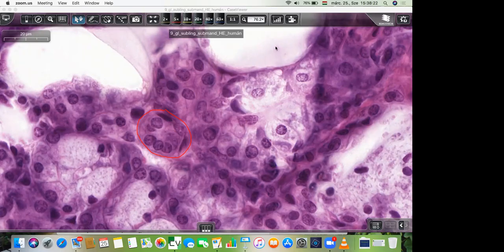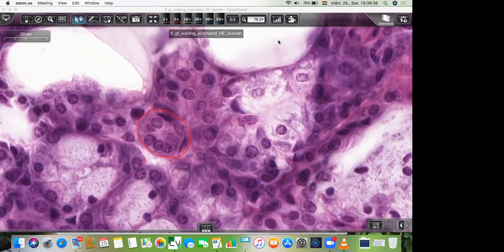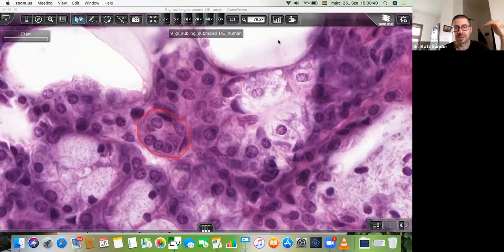You're welcome. Dr. Katz? Yes. Did you say that the excretory portions were more darkly stained, and the secretory more? Secretory is darkly stained. Secretory. Okay, not the excretory. All right. Thank you.